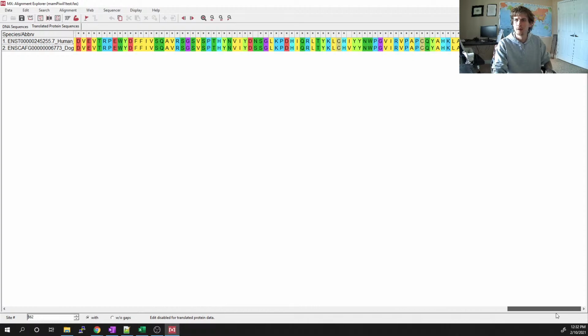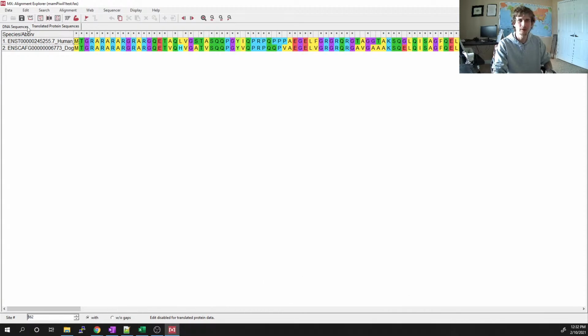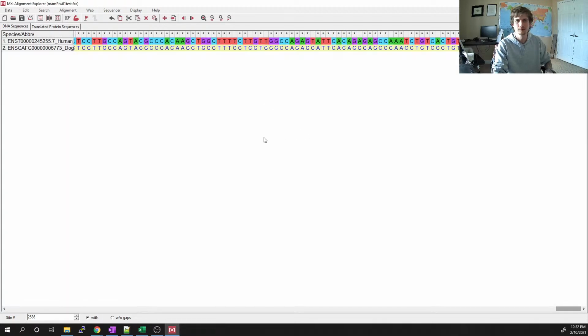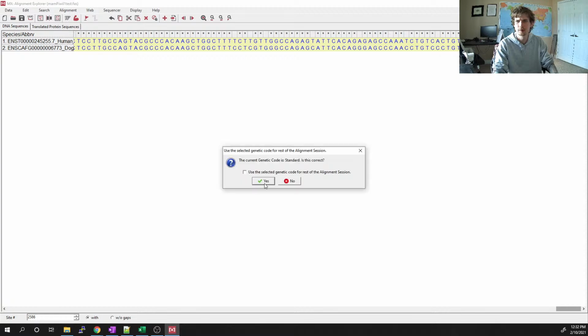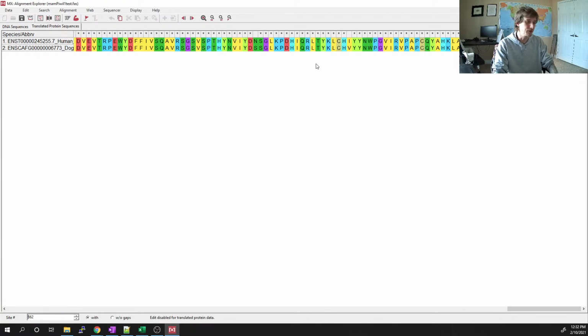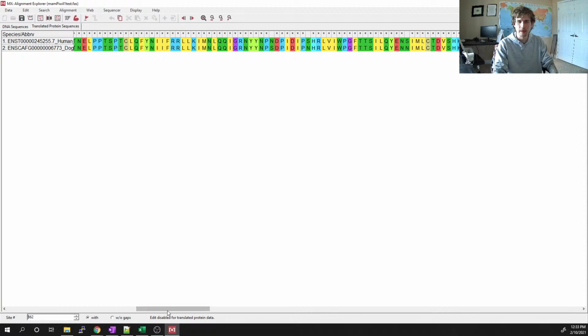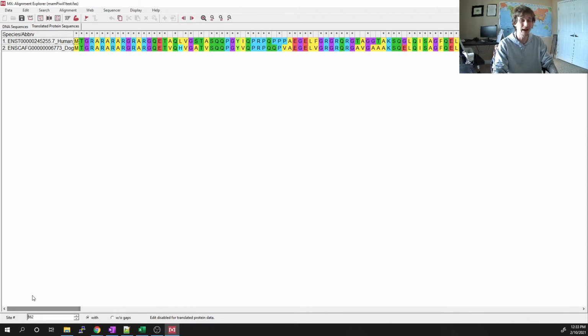Anyways, if we take a look at the sequence, the DNA sequence is kind of variable, right? We see some asterisks and not so many asterisks. But whenever we look at the protein, when we look at the amino acid sequence, oh my gosh, we see a lot more asterisks, right? Because what we're observing is that most of those changes are going to be silent mutations, or silent changes in the third codon position.